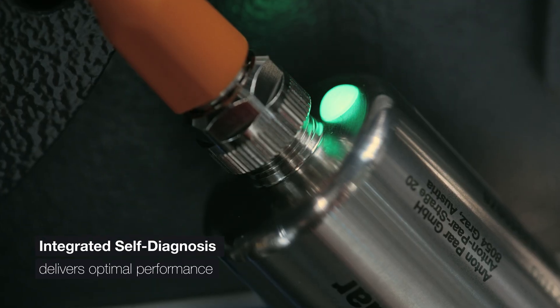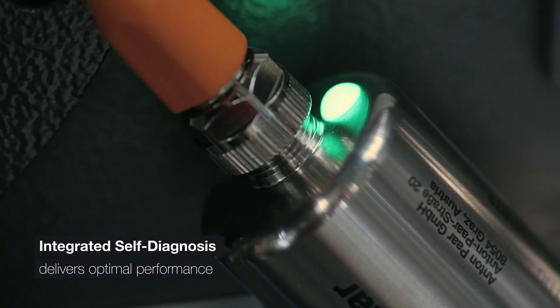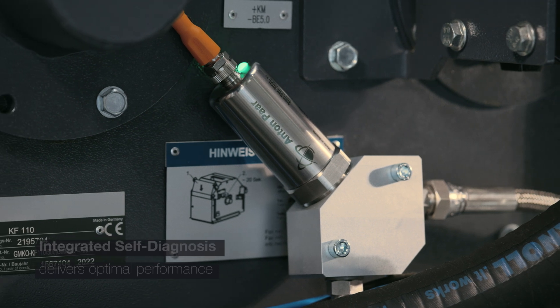It seamlessly integrates with existing systems. Stay ahead with built-in self-diagnosis, ensuring optimal performance at all times.